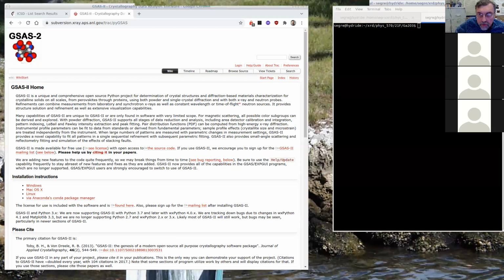All right. So I'm going to share my screen because I think this will work better if you can see what I'm doing. And let me know if there's any issues.